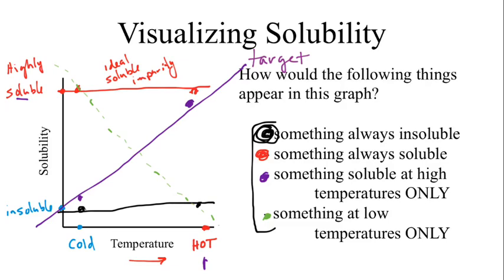And then the last one would be our ideal insoluble impurity. Okay? One that's more common than not is sand. Sand tends to show up in a lot of products or purifications coming from organic chemistry because we use it in other techniques that we'll see this semester. So that's kind of the idea on where things are on our curve.